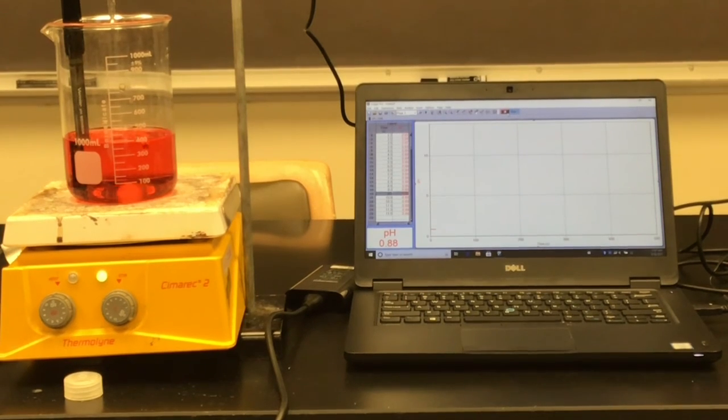I think I need it to go a little faster than this. So forgive me, I'm going to change this. Need to make it go just a smidge faster. Got to get it just right. Too fast, too fast. There we go. That's what I want. Okay. So now I'm at a constant rate. I've left it alone, and it's drip, drip, dripping away.